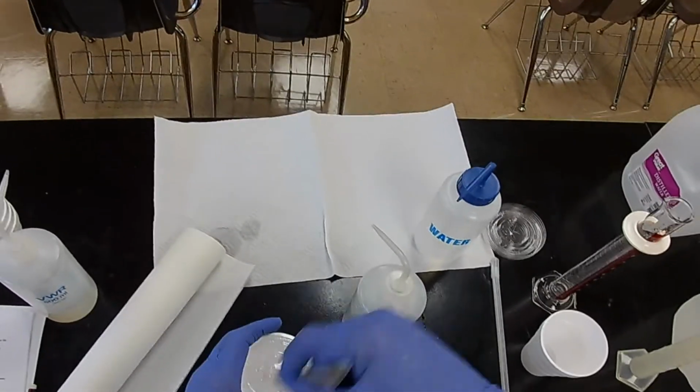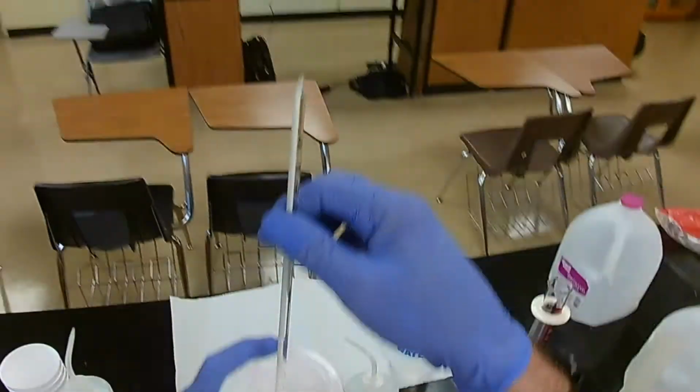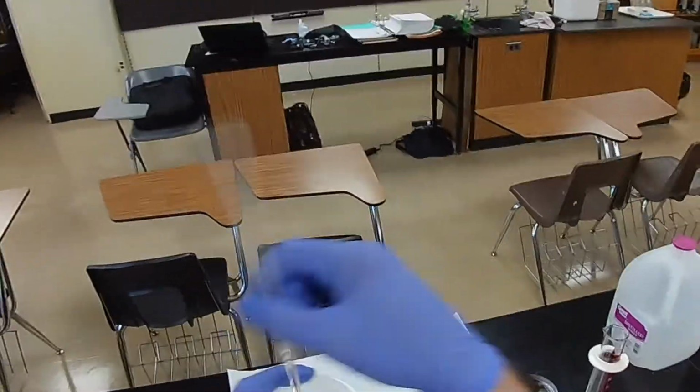Here we go. As it goes into solution, what's happening to the temperature? Oh, it's dropping. What does that mean? That means we have an endothermic reaction, a heat of solution that's endothermic.